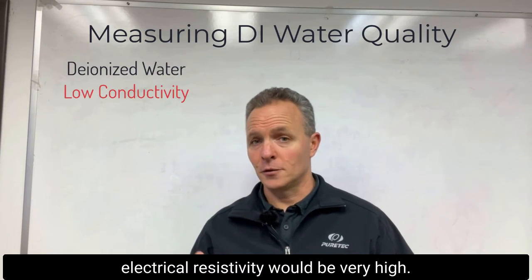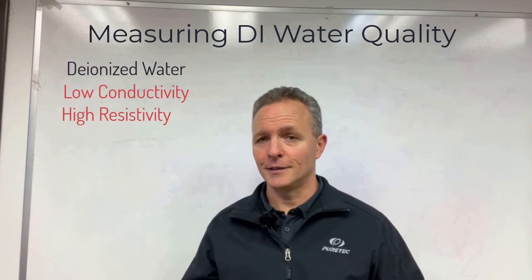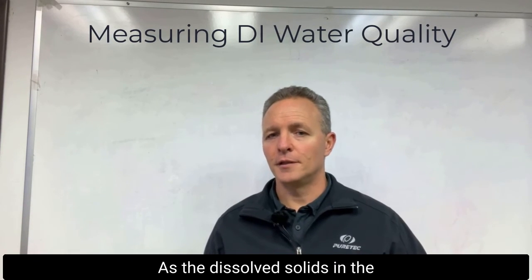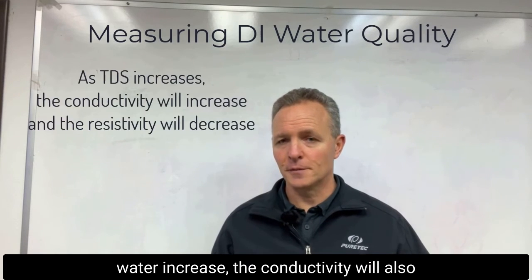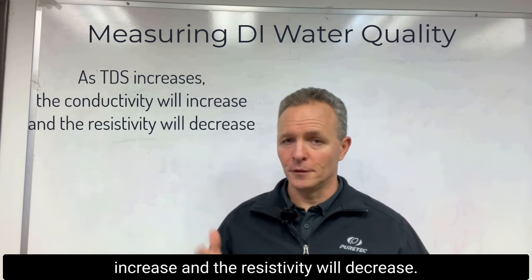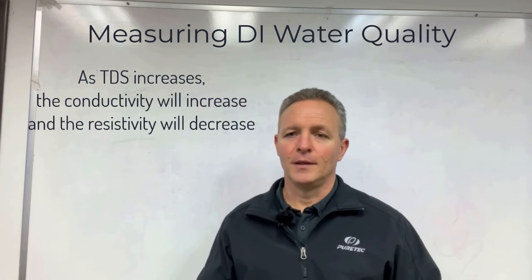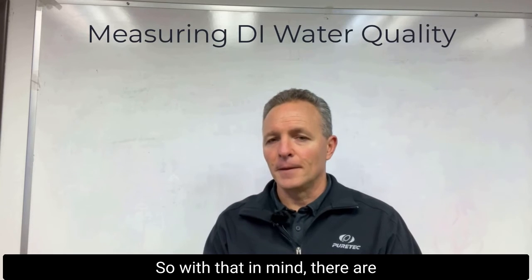And the electrical resistivity would be very high. The opposite is also true: as the dissolved solids in the water increase, the conductivity will also increase and the resistivity will decrease.